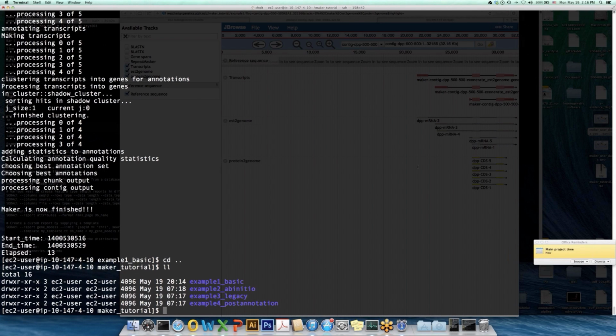And if you use that untarred partial directory in all of the examples, you won't even have to switch back out of the micro instance. It's okay because you'll still be able to follow along with the tutorial. You just have to pre-fill the reports using that partial .tgz file before running Maker, and then it will still run even on the micro instance.